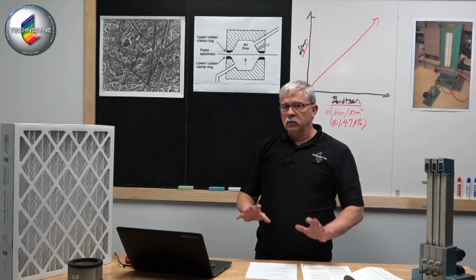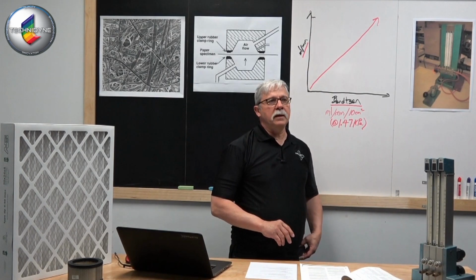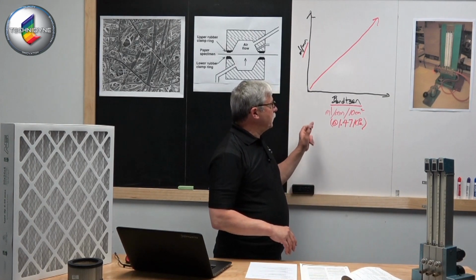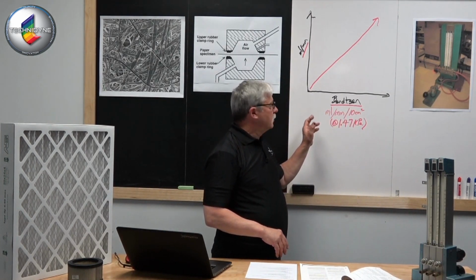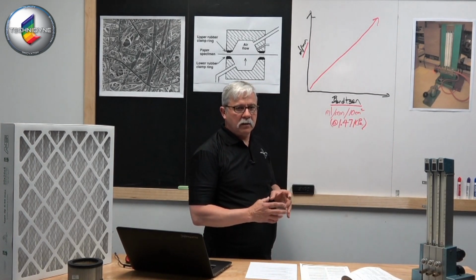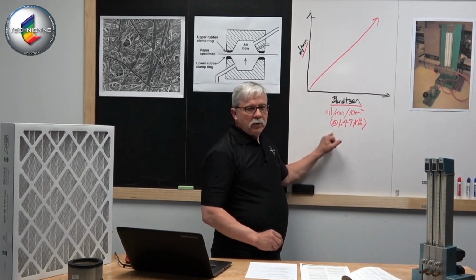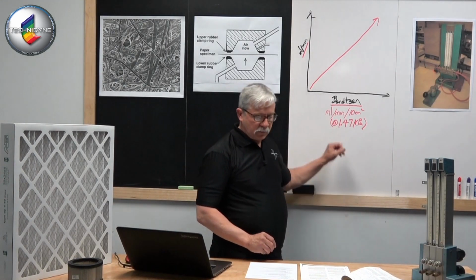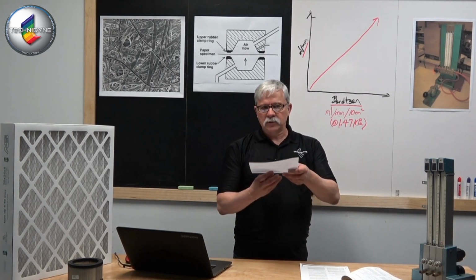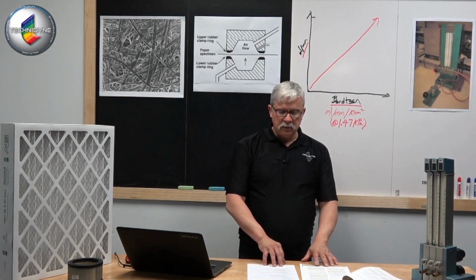Now, their units were specifically designed around the area that they were testing: 10 square centimeters, the aperture size that they used in their clamping mechanism, at 1.47 kilopascals pressure differential. So you have a product, you have your pressure differential, it's exiting the sample, going to your rotameter tubes, and now you have a Bendtsen measurement.